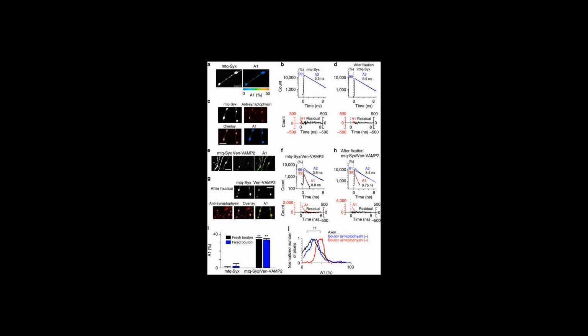τ = Δt / ln(D_0/D_1). For multi-exponential decays, this equation provides the average lifetime. This method can be extended to analyze bi-exponential decays.